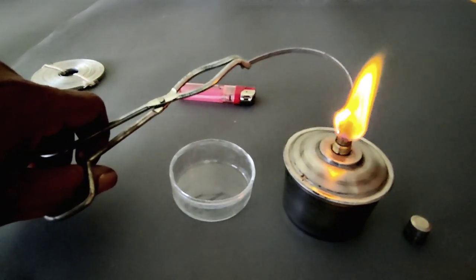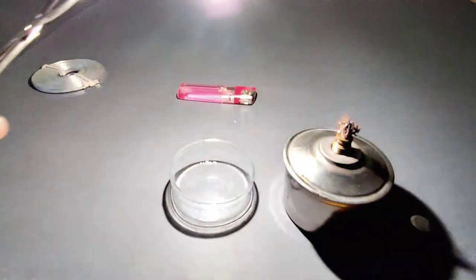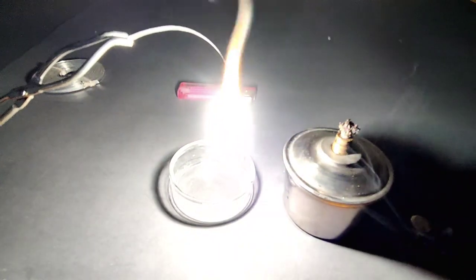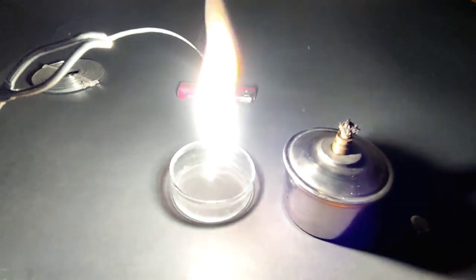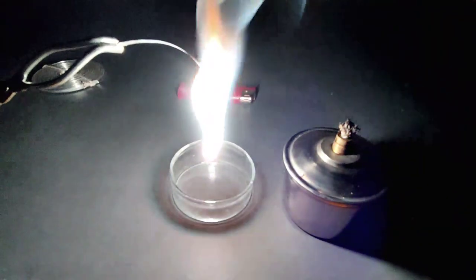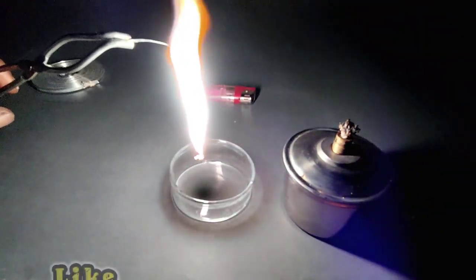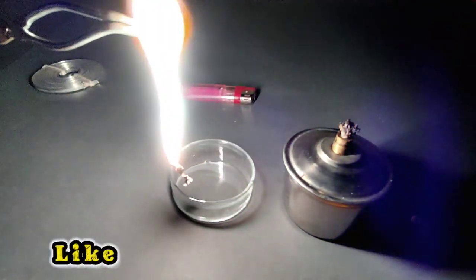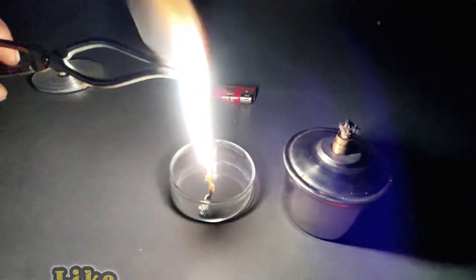We will notice that magnesium ribbon burns in oxygen by producing a dazzling white flame and changes into white powder. This white powder is magnesium oxide.